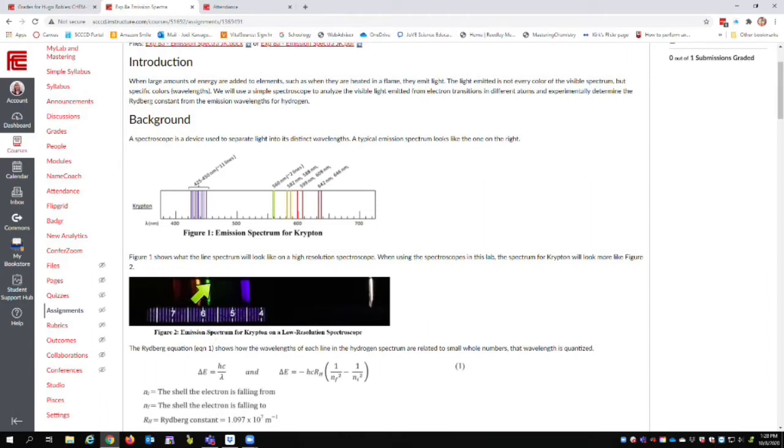And then here we see some green. From looking at this, we see it's actually two lines. The yellow here is appearing as one line, and then we're only seeing very faintly the orange and green, the orange and red lines here. Now the scale here is backwards because of how the transmission grating works, and so this is 4 going to 7 to the left, not the way we usually read things.